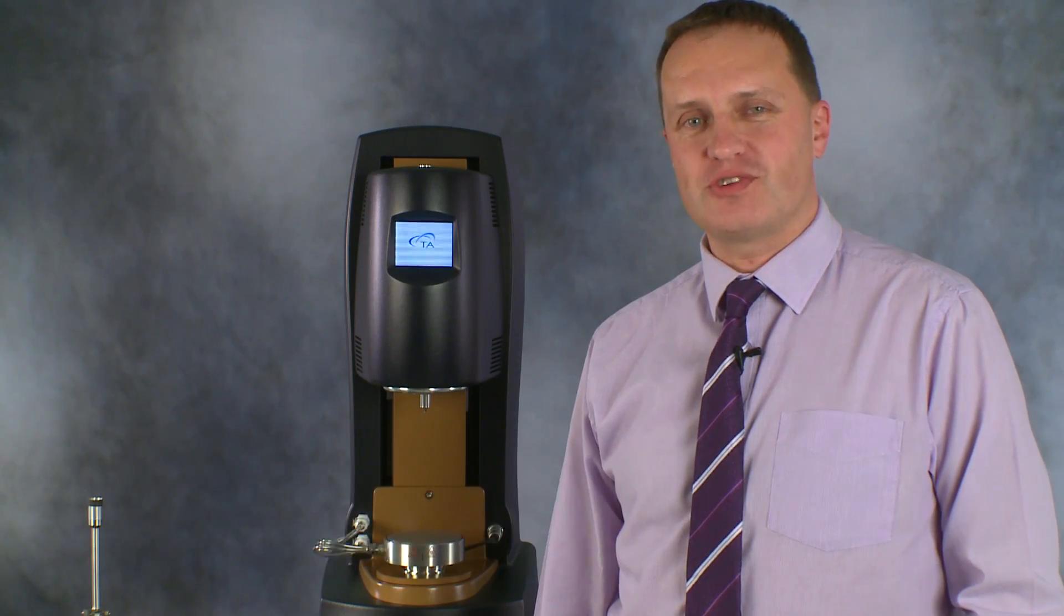Welcome to today's TA Tech Tip where we're talking about choosing the right geometry for performing experiments on your DHR rheometer.